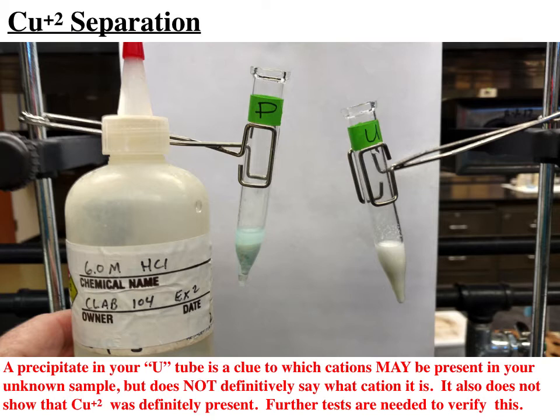Well, we see that the unknown tube shows a precipitate too, but we are not really sure what that precipitate is. We know this for sure right at this juncture, that the unknown tube must have silver, lead, or both silver and lead, because precipitates of those materials should form.